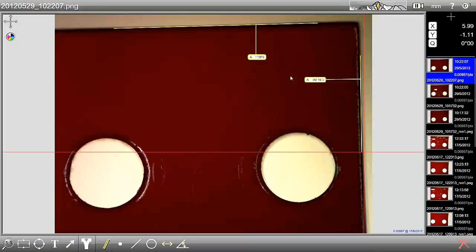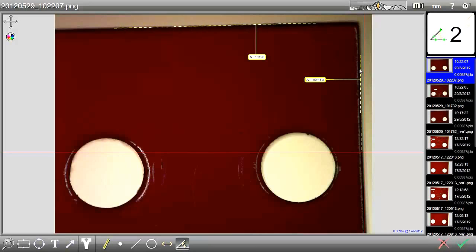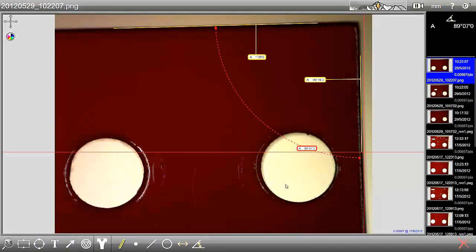Once we have now got these two lines, we can find the angle between them. To achieve this, you select the angle icon, select line 1, then select line 2. The information is then shown in the green arrow here. As you can also see, the angle is shown between the two lines.